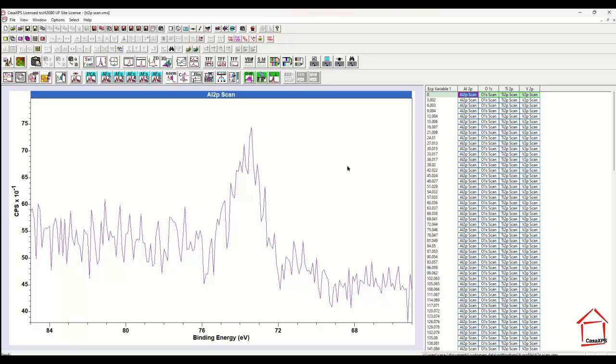These data represent an XPS depth profile. An ion beam has been used to sputter the surface, and after each cycle of the ion beam, a set of spectra are acquired.